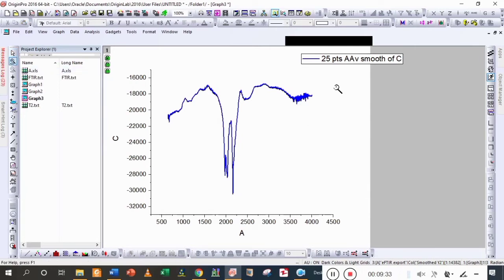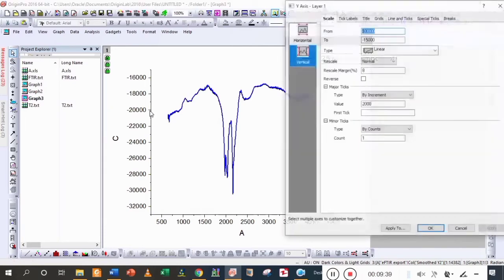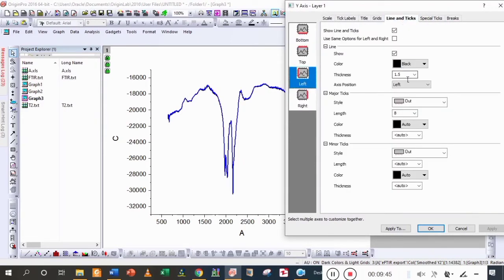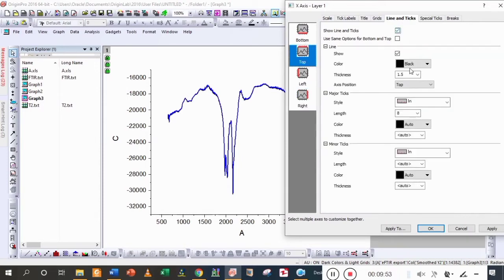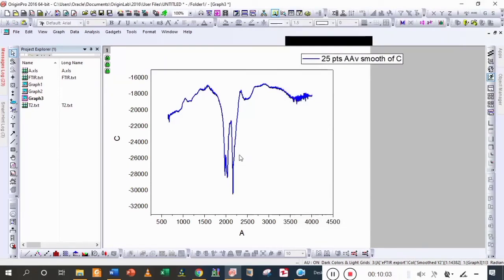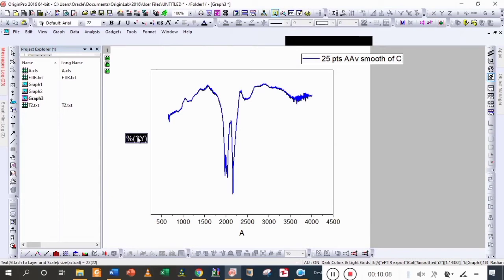Now we are going to change it to standard form. Firstly, we rescale its scales, lines, and titles. You can choose the same or your own desired settings. I'm going to delete the intensity label because the values are in percentage — we just write the unit as transmittance and its unit is percentage.